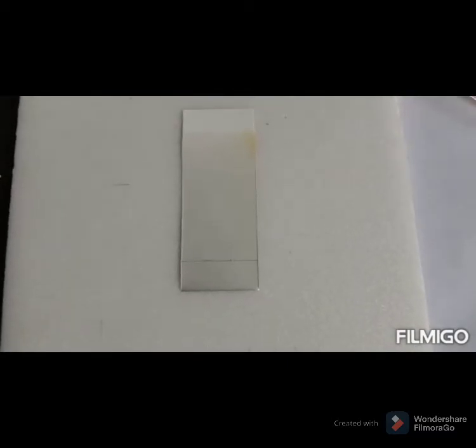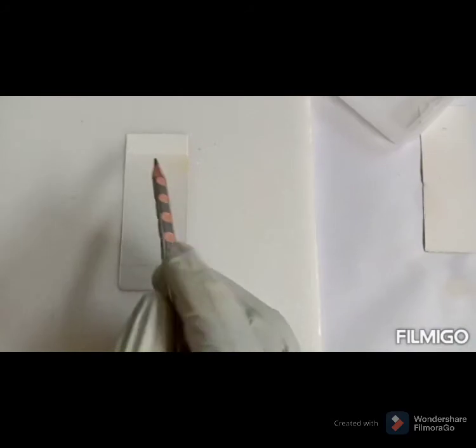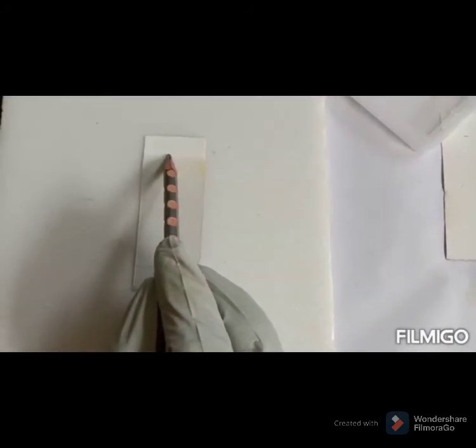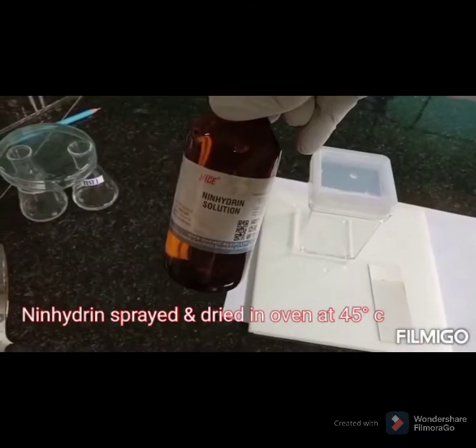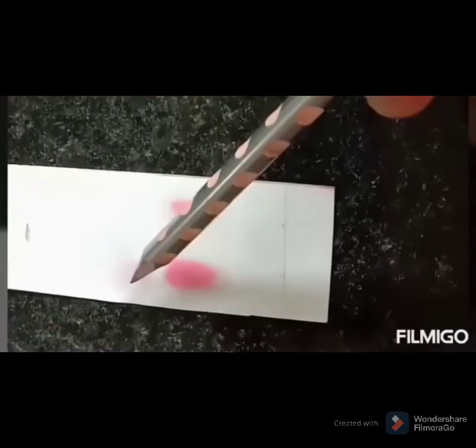Again, do not use a pen here, and allow the plate to dry in air or in an oven at 45 degrees Celsius. With the solvent front marked, the solutes can be visualized using 1% ninhydrin for detection of amino acids, which is sprayed on the plate, and the plate is dried in air or a hot air oven.